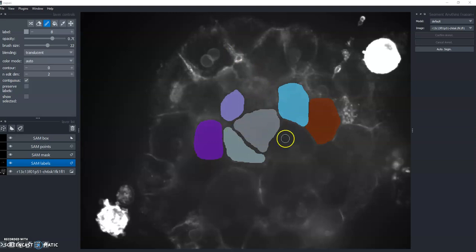And perhaps more importantly, when I do these questions, instead of doing a Wordle, I'm just playing around with some ImageSC question. And so my labels are going to be pretty sloppy, to be honest. And if you're the actual researcher doing this problem, you can devote a lot more time to hand drawing better labels.